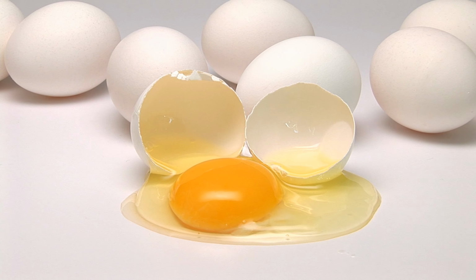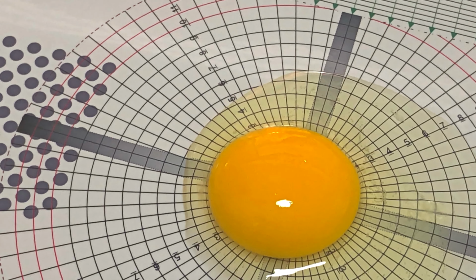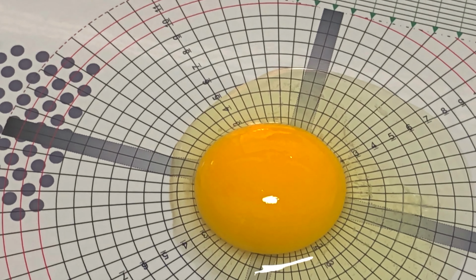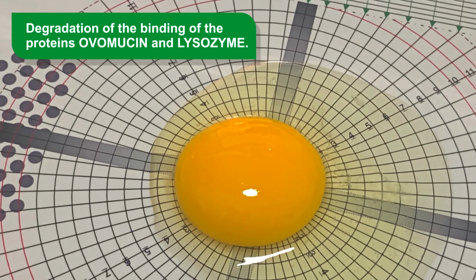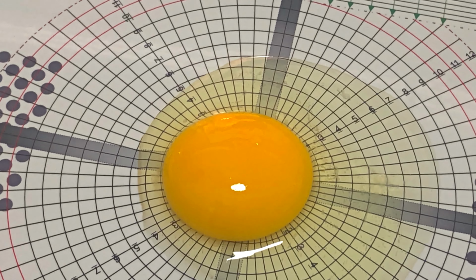Along with the height of the air chamber, the consistency of the albumen is one of the indicators of the freshness of the egg. After oviposition, the consistency of the albumens decreases over time. This occurs due to an increase in pH, which leads to the degradation of the binding of the proteins ovomucin and lysozyme, which make the albumen more and more fluid.